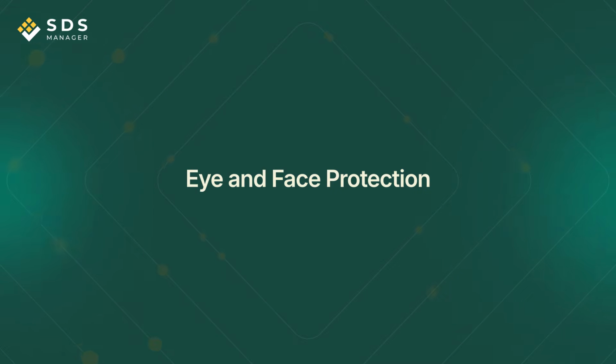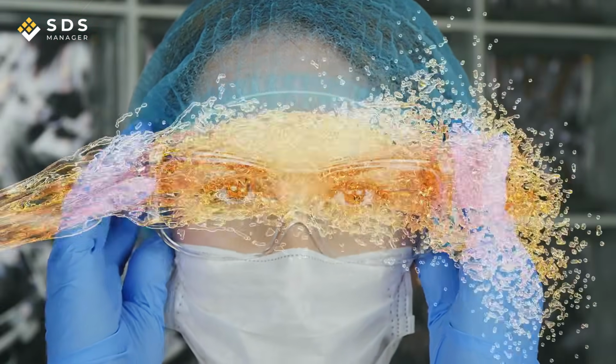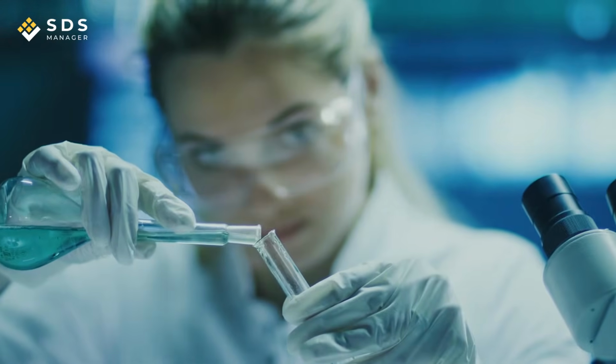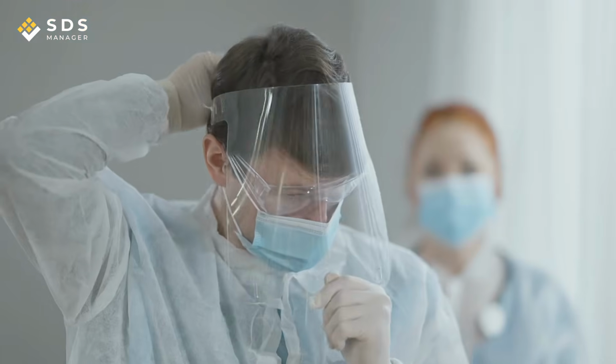Eye and face protection. Safety glasses provide basic impact protection but offer limited defense against chemical splash. Chemical splash goggles form a seal around the eyes and are the right choice when there is any risk of liquid splashing or vapor exposure. Where the entire face is at risk, a full face shield should be worn over the goggles, not instead of them.